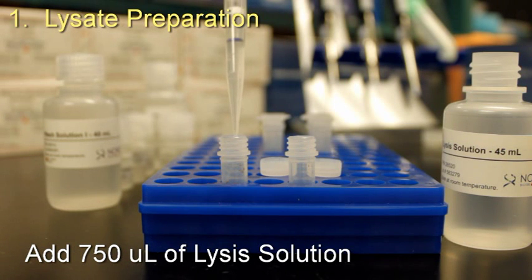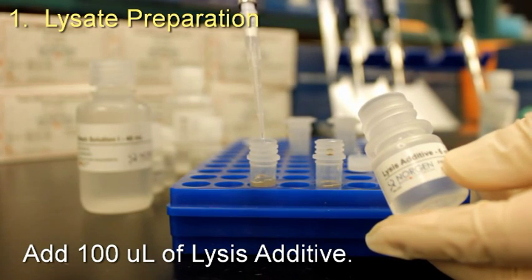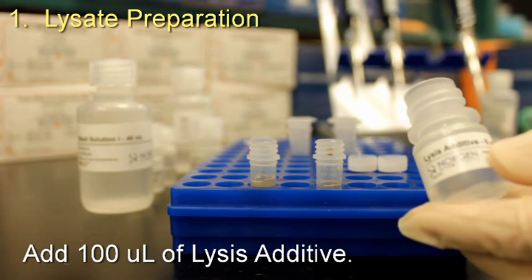Add 750 microliters of lysis solution to each bead tube and vortex briefly to mix. Add 100 microliters of lysis additive to each bead tube.